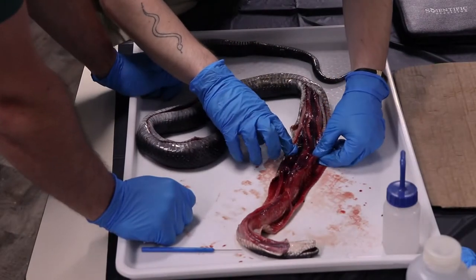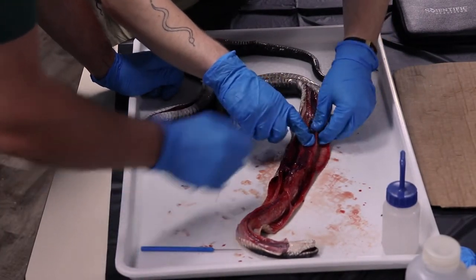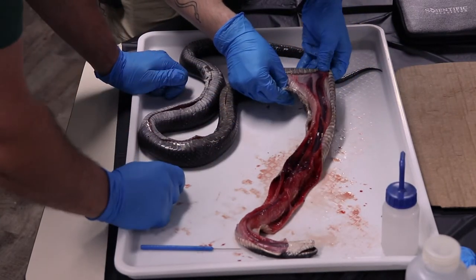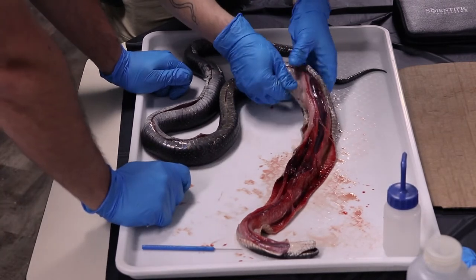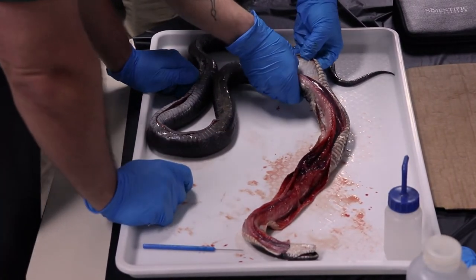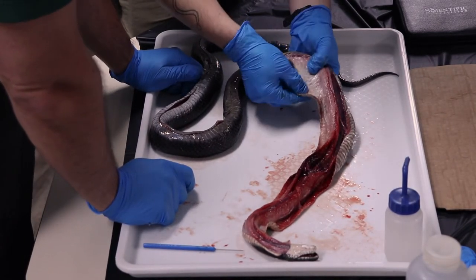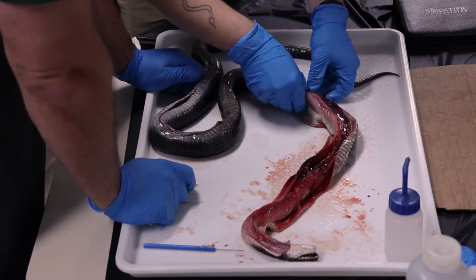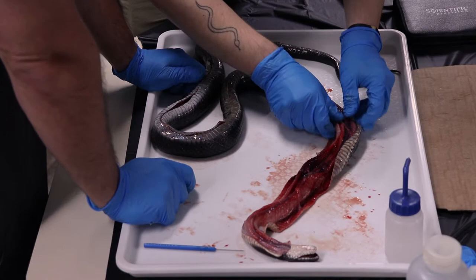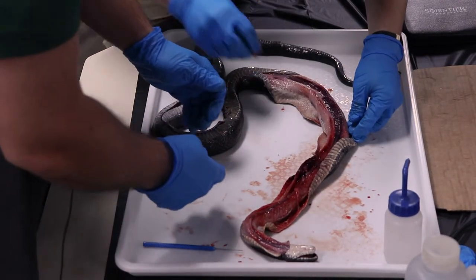Oh, there's a big long liver, I'm guessing. Yeah, that big long dark organ there. I was going to say this guy right here. Or is that underneath some membrane? I can't see what I'm looking at. Yeah, that's all long liver, I think. There's a membrane that covers up all this stuff on the ventral surface. Sometimes you have to get that off.